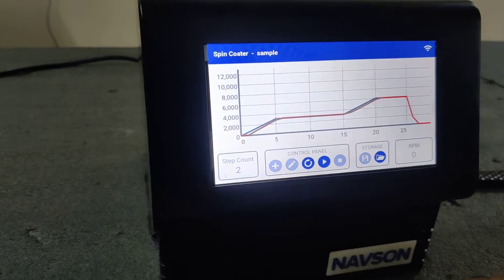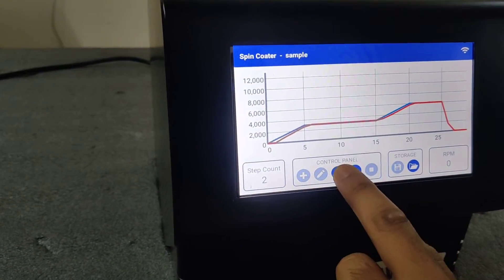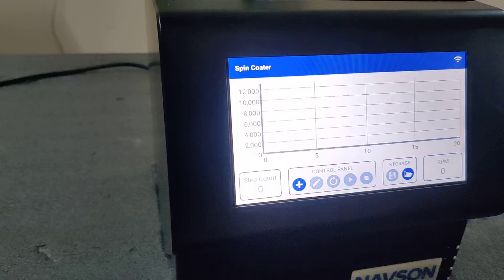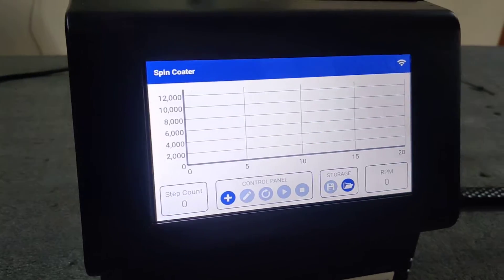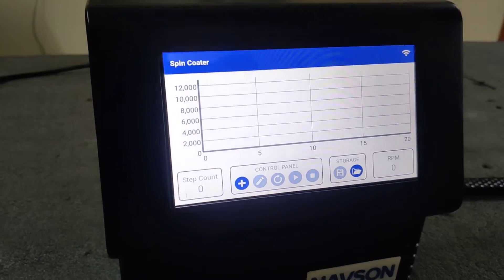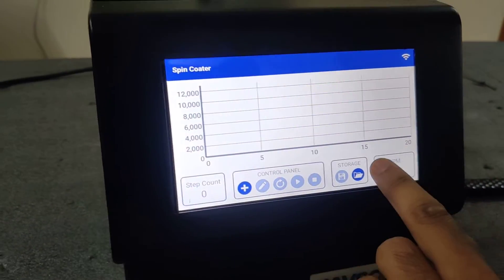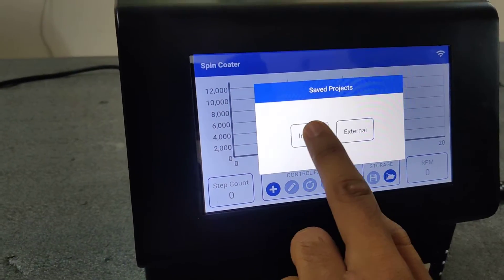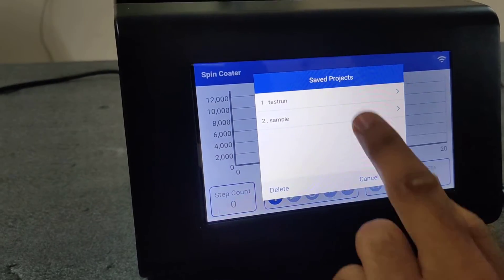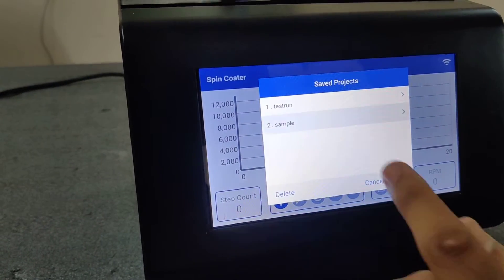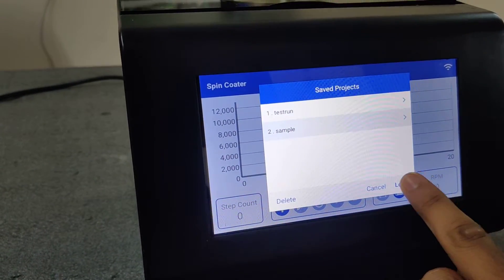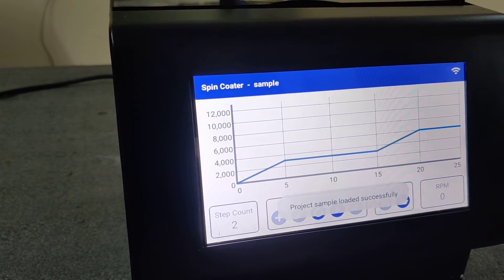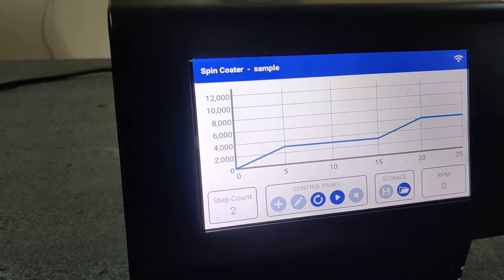Now you refresh the screen. So now you want to go back to saved program, open internal sample, load. Now you play it.